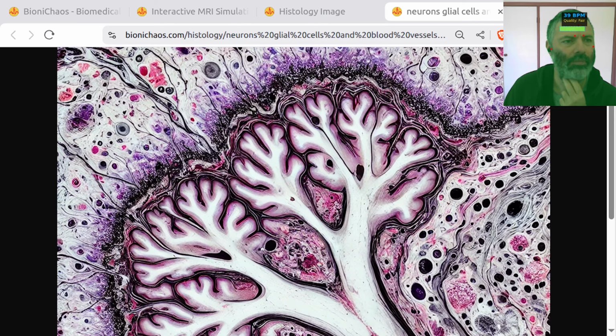Sure. 1. The threshold slider adjusts pixel intensity to filter regions. 2. The segmentation method dropdown lets users choose how to segment the image, such as watershed or k-means. And 3. The feature toggle shows or hides additional visual markers, like cell boundaries, on the image.